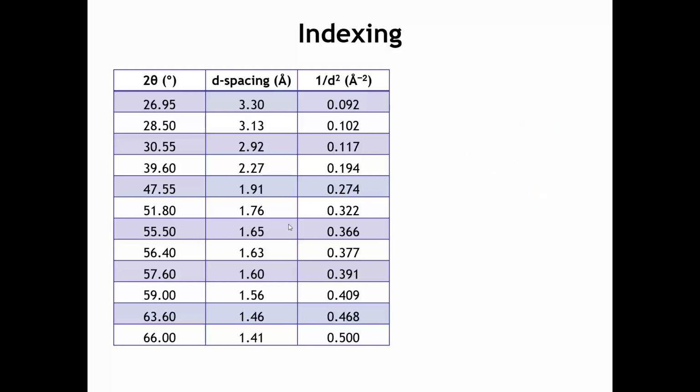Well, were you able to figure it out? Were you able to index it? Were you able to make any headway? It took me a little while to do this when I worked through it on my own, so don't feel bad if you weren't able to figure it out. But let's go through the approach to indexing this powder pattern.